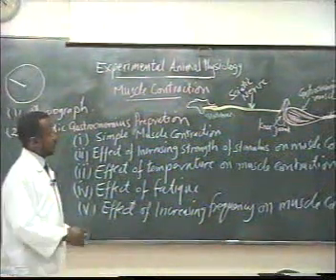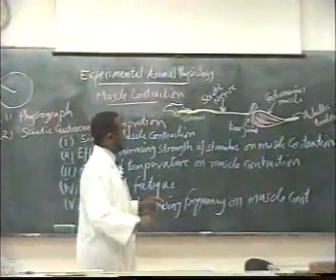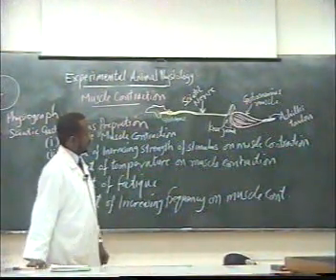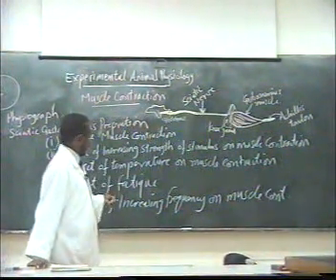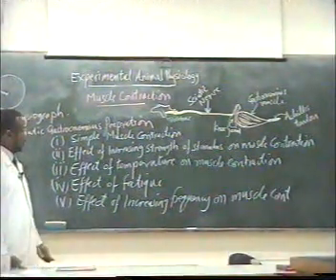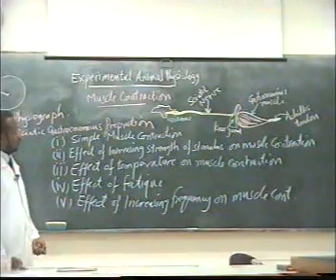So we can demonstrate the effect of increasing the strength of the stimulus: we see the change in the amplitude of contraction, and also we record muscle contraction when we increase or change the frequency of stimulation.